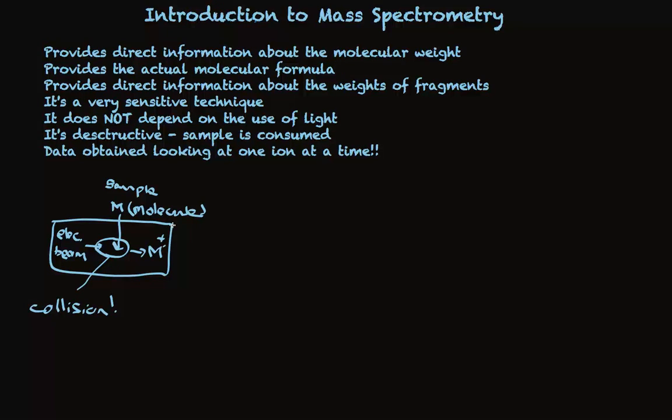A second part of that machine, and those molecules that are now what we call molecular ions, travel through here and they are separated and analyzed.